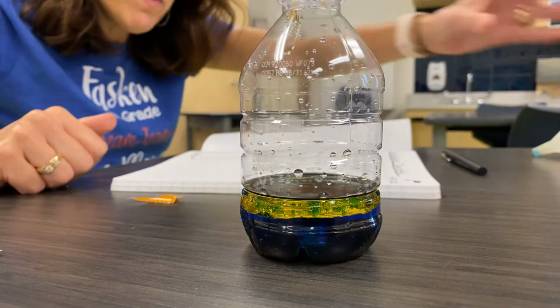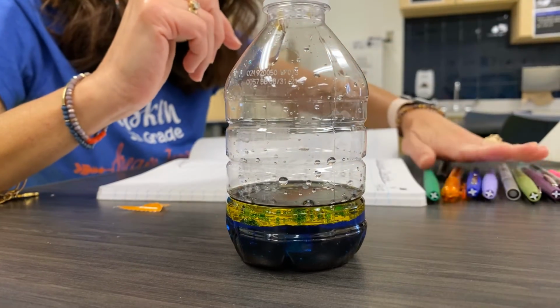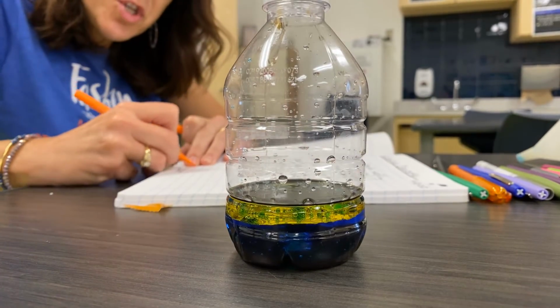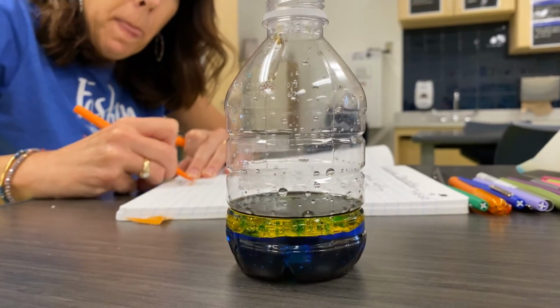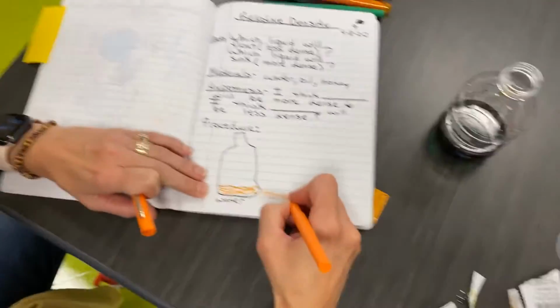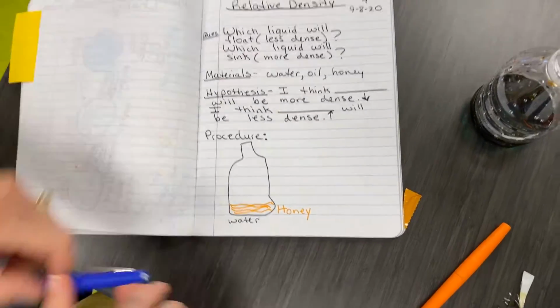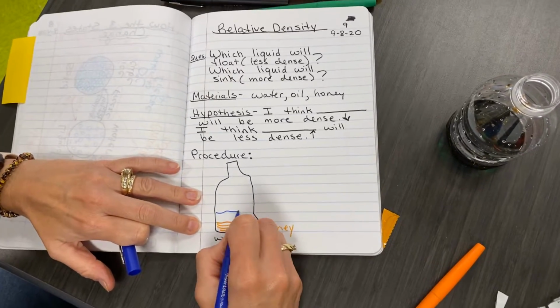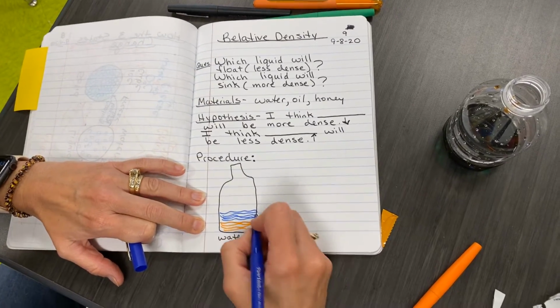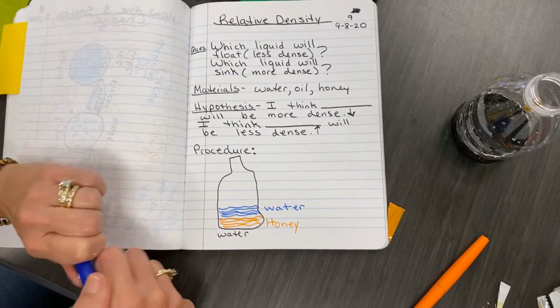All right, so now what we need to do is draw in our results. And I don't have a brown, but I'm going to use orange to be my honey. Okay, remember, you need your drawings to be neat, detailed. Okay, the honey was the most dense. The water is less dense than the honey.